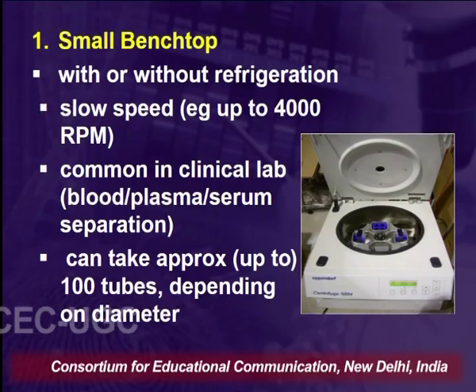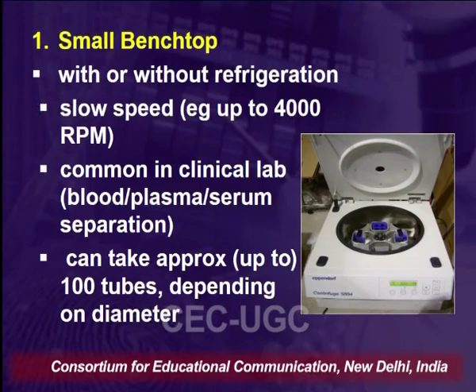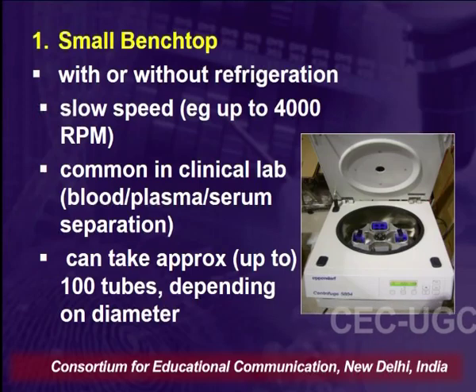Now, what is the necessity of refrigeration in the centrifuge? Whenever we are extracting something, separating something, or purifying something, we require a certain temperature at a certain point of time. This refrigeration will provide a specific temperature which will help us in the purification or the separation of the substance.